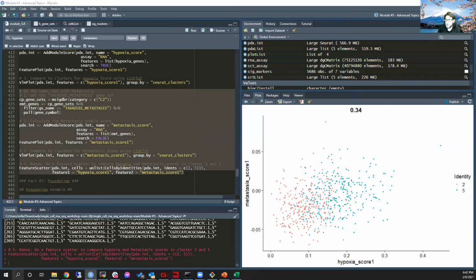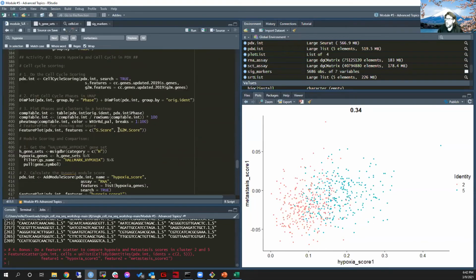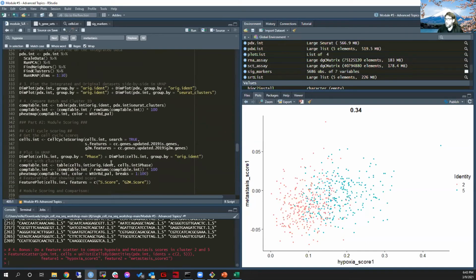The other thing I didn't talk about is integration, right? So, cell type identification using integration to a reference. Just like we integrated our different batches from our PDX, just like we integrated our different cell lines from our Ewing sarcoma cells, you're able to also integrate a query to a reference.